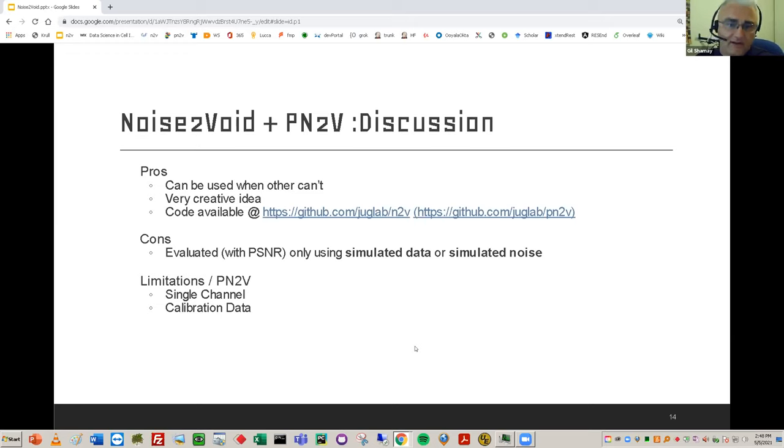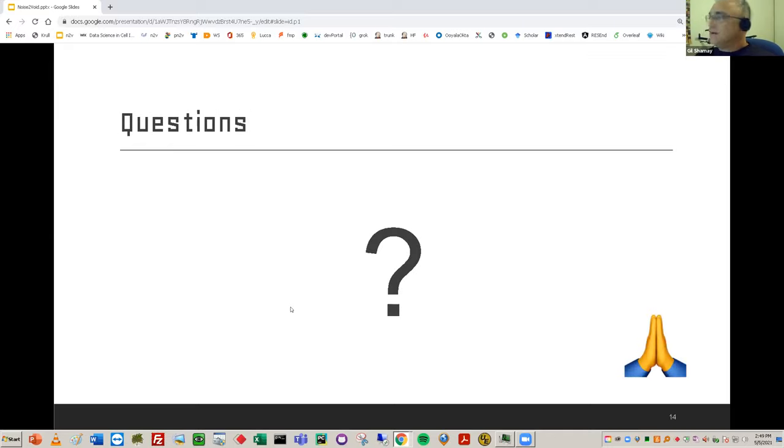They have a limitation that they currently work only on a single channel, and they require the calibration data. We are not fully aware of how this data is available with datasets. We asked the author about that. When we get an answer, we'll update. That's it. Any questions?